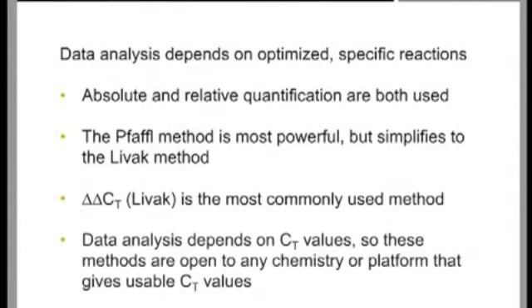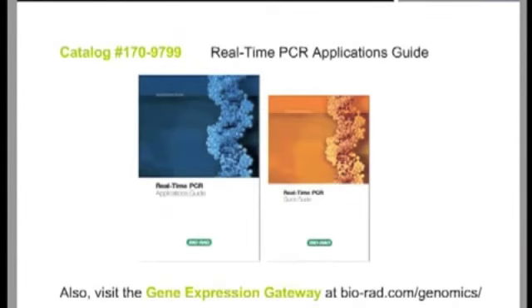Finally, all data analysis methods are based on CT values, making them available for use with any reaction chemistry or platform. We hope that this tutorial answered your questions.